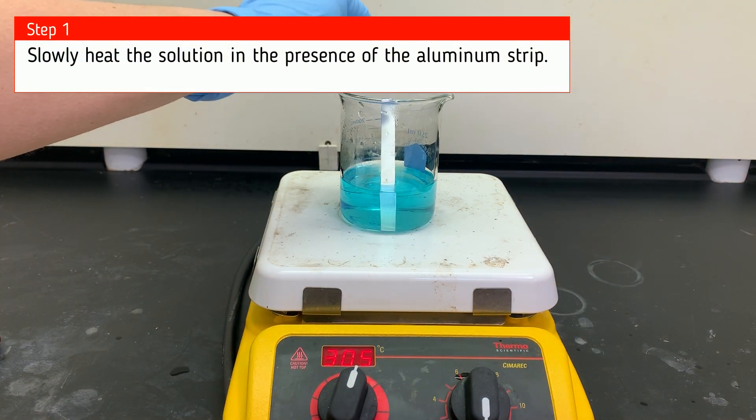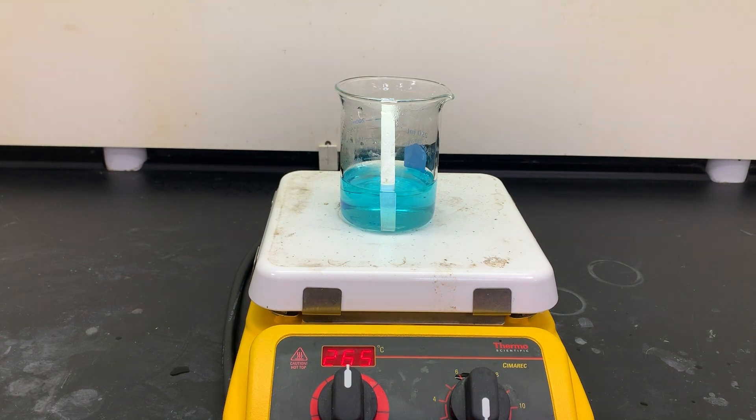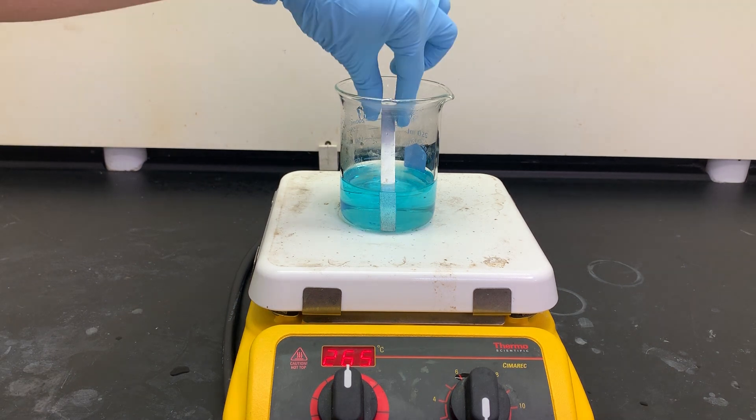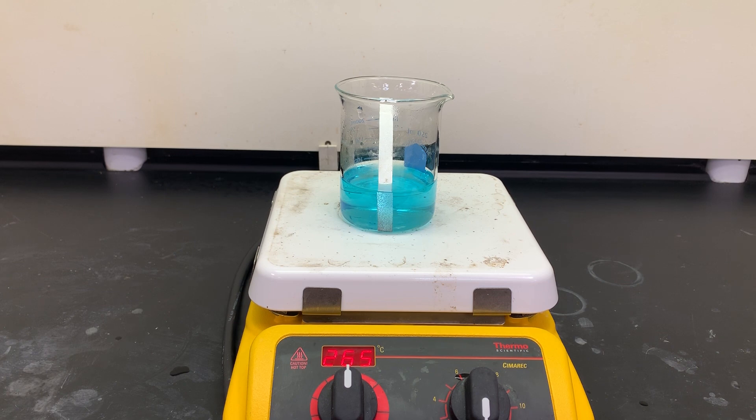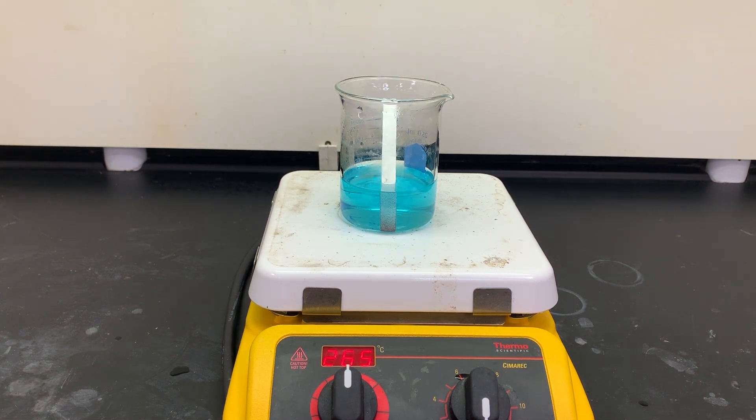We're going to take that aluminum strip and put it into our copper 2 chloride solution. Then we're going to slowly heat. This takes a really long time, and as we're doing this, you're going to see copper building up on the aluminum strip. We're going to scrape that copper off or tap it off so that more aluminum is exposed to be able to react.